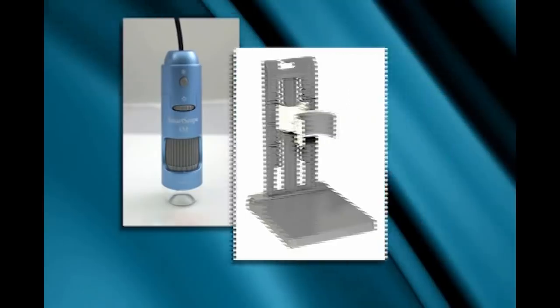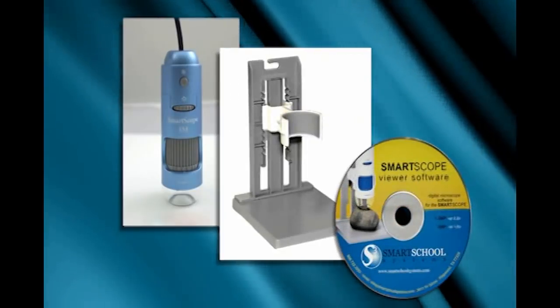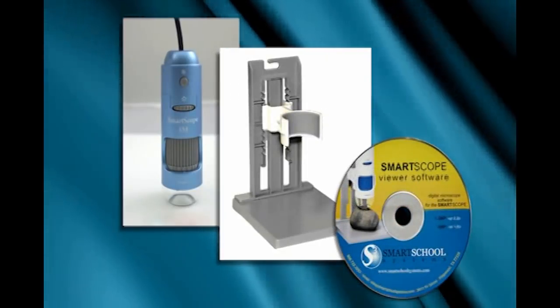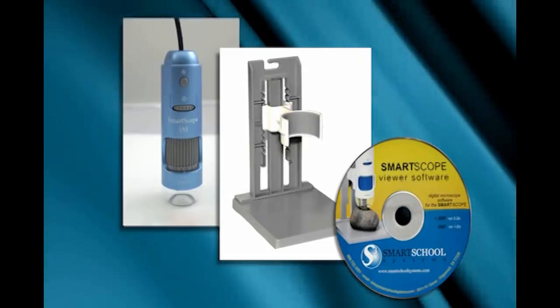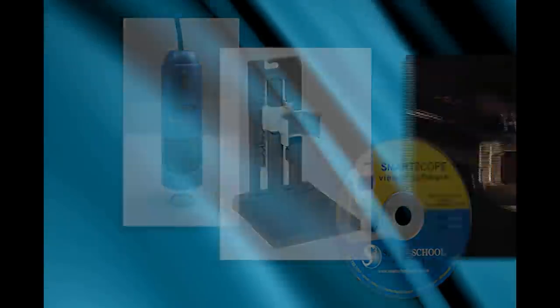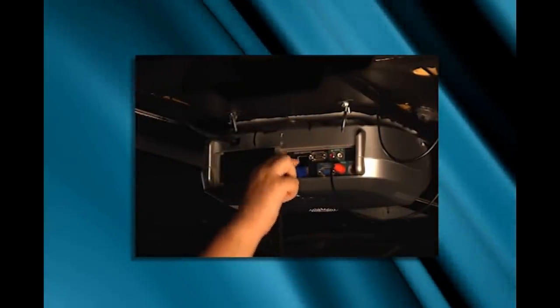Included in the package is the SmartScope 5M, the stand, and the software site license, so you can install the software on all of the computers on your campus. The software is compatible with both PCs and Macs, and the SmartScope 5M works great with interactive whiteboards.